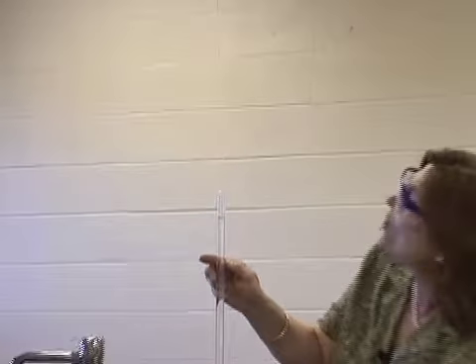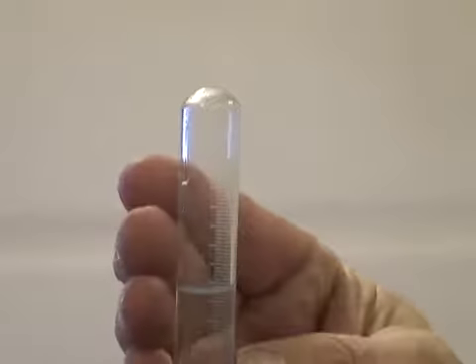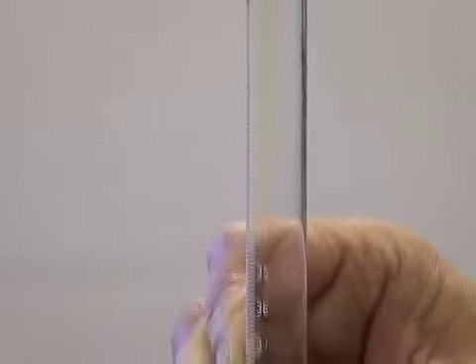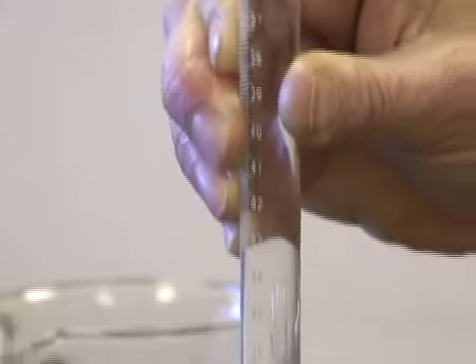And my initial volume will be 6.6 milliliters. Now I'm going to wait, and possibly if we get up close, you can see that hydrochloric acid moving down that eudiometer until it reaches that magnesium. Moves down, down, down. But it gets pretty exciting once it reaches that magnesium.